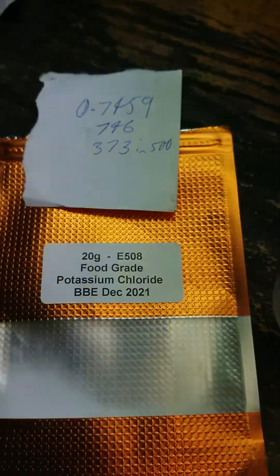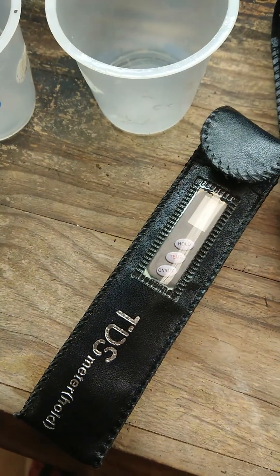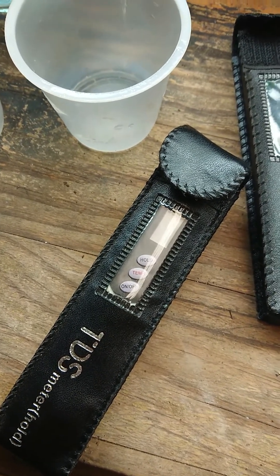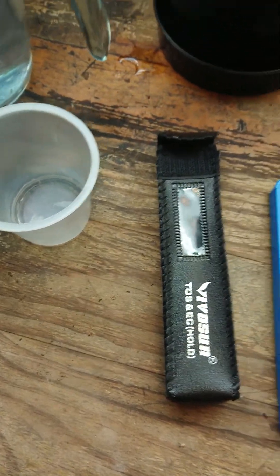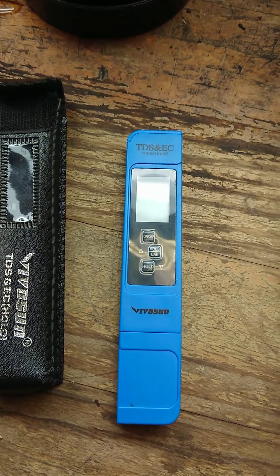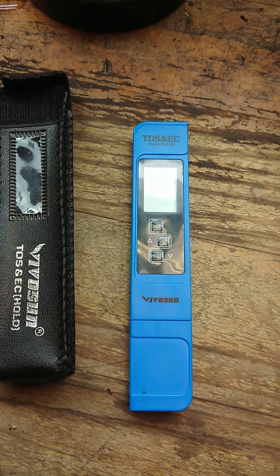The calibration process is quite simple. I've tested this against an HM Digital TDS meter and now have both meters reading pretty much the same, within 10 to 20 parts per million, so the calibration does work. It's meant to be done at 25 degrees Celsius, but supposedly the Vivosun unit has a built-in automatic temperature adjustment capability, though I'm not entirely sure about that.